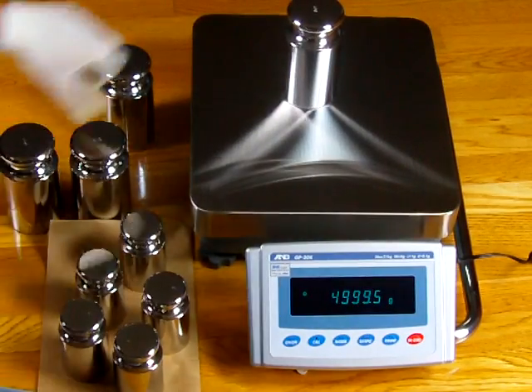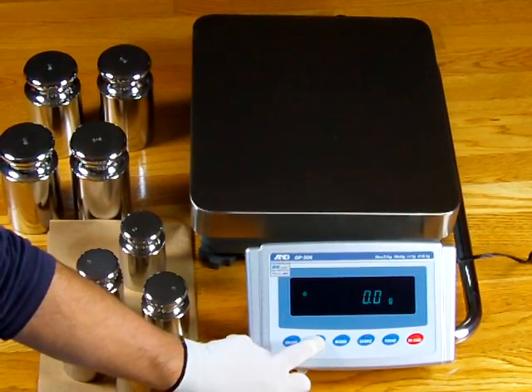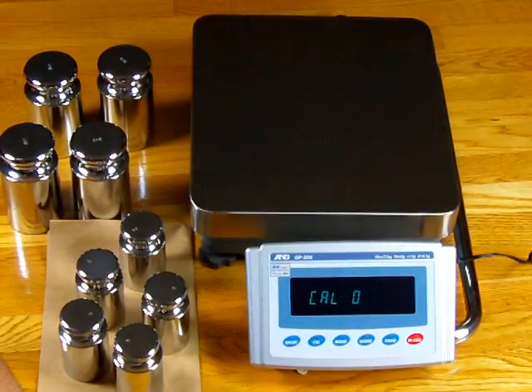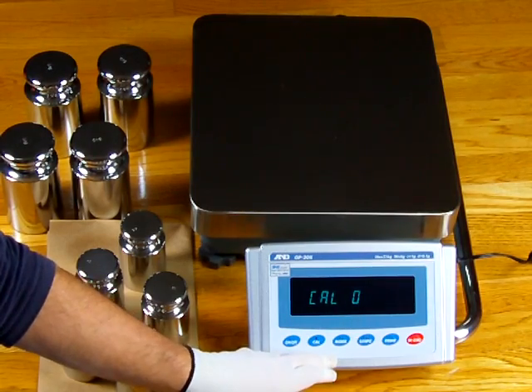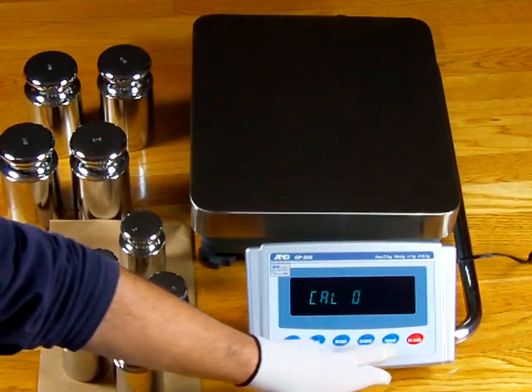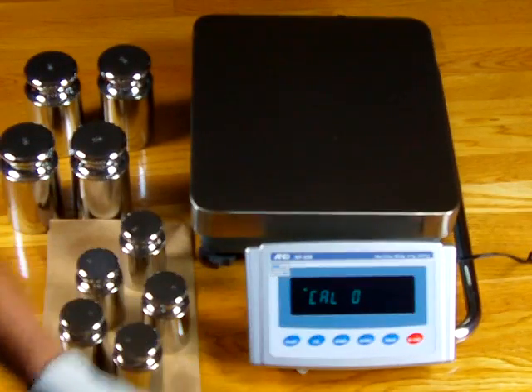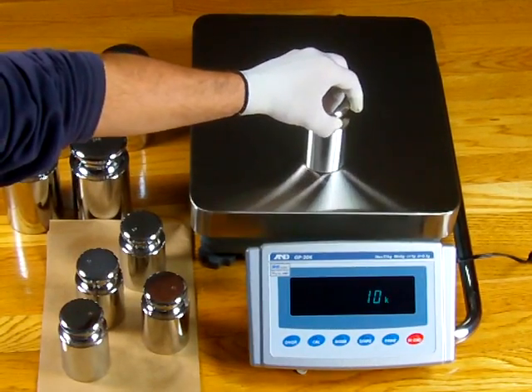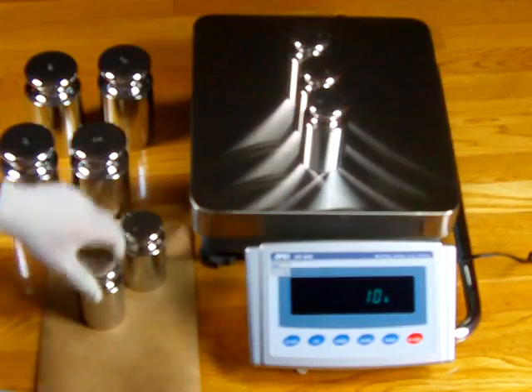To do an external calibration, press and hold the CAL button. You'll see CAL IN, then CAL OUT — release, and it says CAL ZERO. On this particular balance you can switch the cal weight required to either 10 kilogram or 20 kilogram. Press the print key to start the calibration — it stores nothing on the platform — then it says 10 kilograms. We're going to put 10 kg on using our higher-quality Class 1 calibration weights, which are very expensive and have a tighter tolerance.